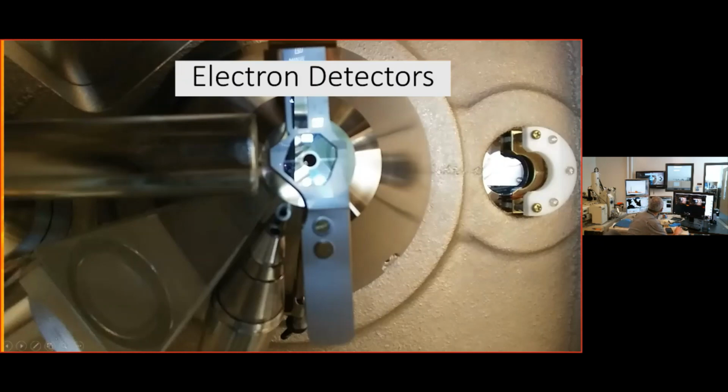And this is just a picture of what the situation looks like in my instrument now. This is looking up the column. The beam will come out of that hole there. The detector around that hole is a backscatter detector. And this detector back here is a secondary electron detector. And this is the X-ray detector here, and we'll talk about that a bit later.